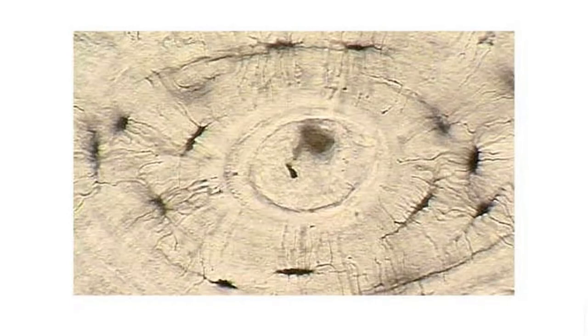Very close-up shot of the tree ring. So what we're looking at here is a very zoomed-in osteon. That is the central canal. The edge of the osteon is way out here somewhere. I can't even see it. We're so zoomed in close.